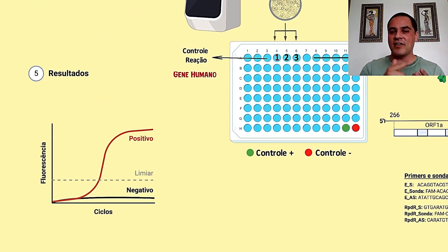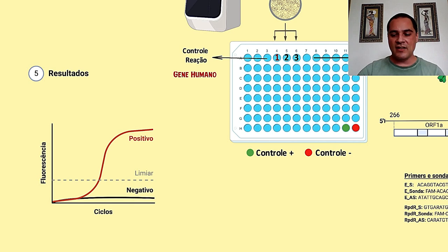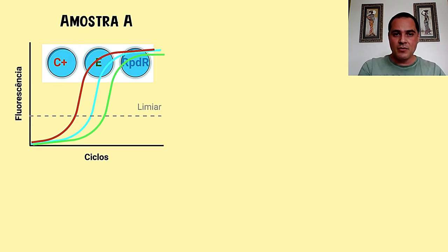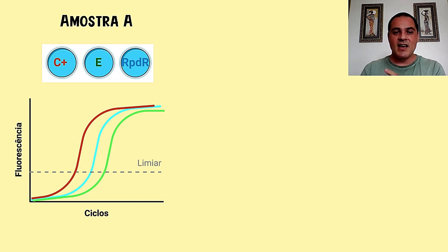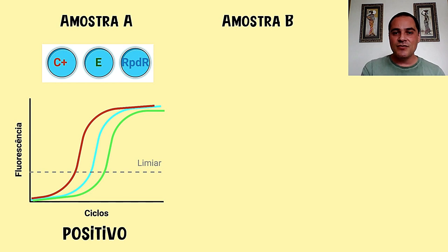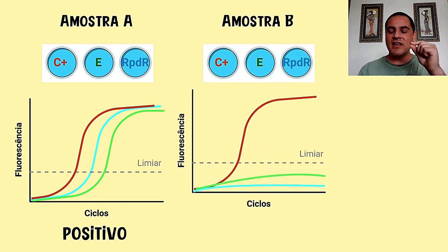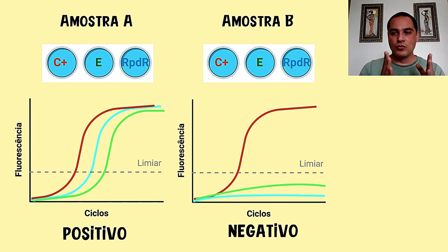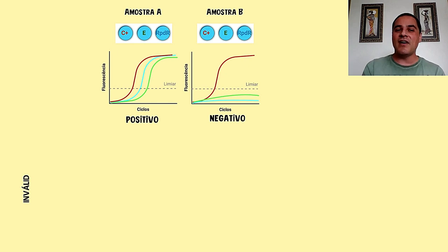Se a amostra for positiva, se teve amplificação, a gente vai ter a presença dessa curva aparecendo acima do limiar, e abaixo do limiar o que for negativo. Vamos para dois exemplos: um caso positivo e um negativo. Na amostra A, em vermelho a amplificação do gene controle humano, e em verde e azul os dois genes virais. Se o paciente é positivo para o novo coronavírus, eu vou ter amplificação obrigatória do gene humano — que garante que o material estava ok — e amplificação dos dois genes virais. No caso de um paciente negativo, apenas a amostra do gene humano tem que ser positiva. Caso o gene humano não seja positivo, a reação não aconteceu, dando resultado inválido ou indeterminado.